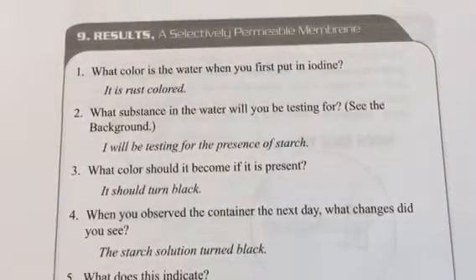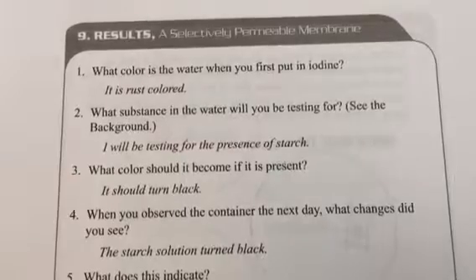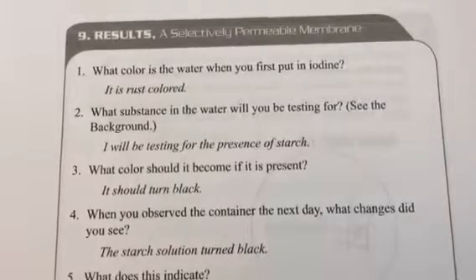This is the semi-permeable lab that you guys did last week for homework. We're going to go over the results page, which is on page 39 of your lab manual, so you can fill in the answers to these questions if you have not yet done so.